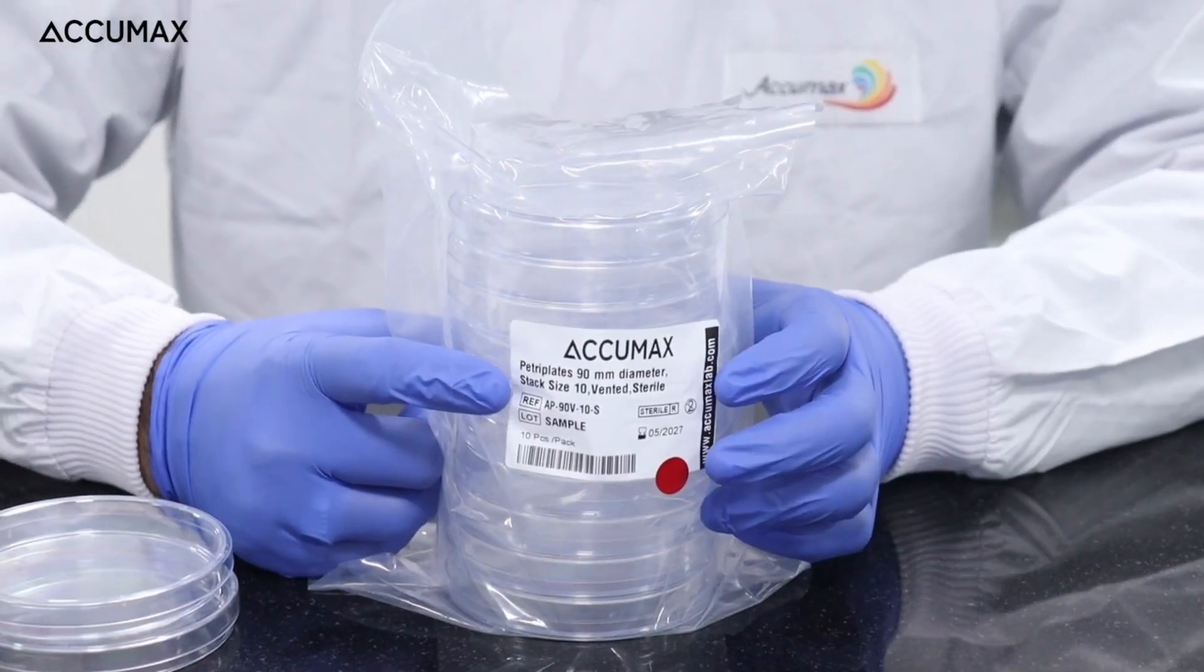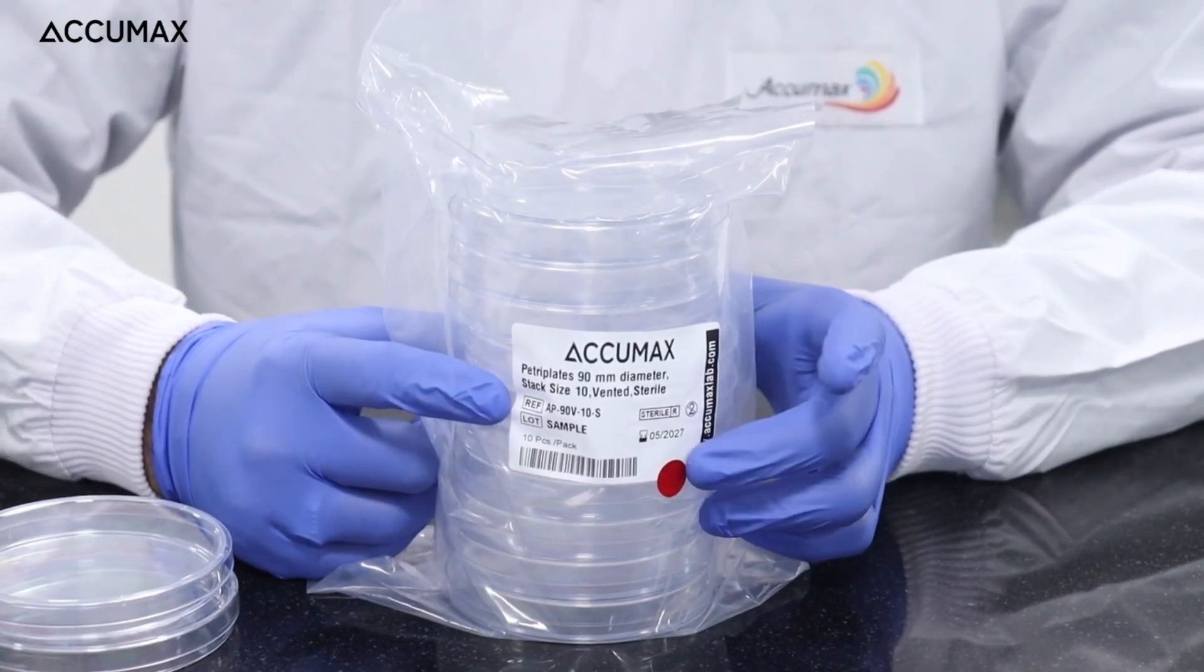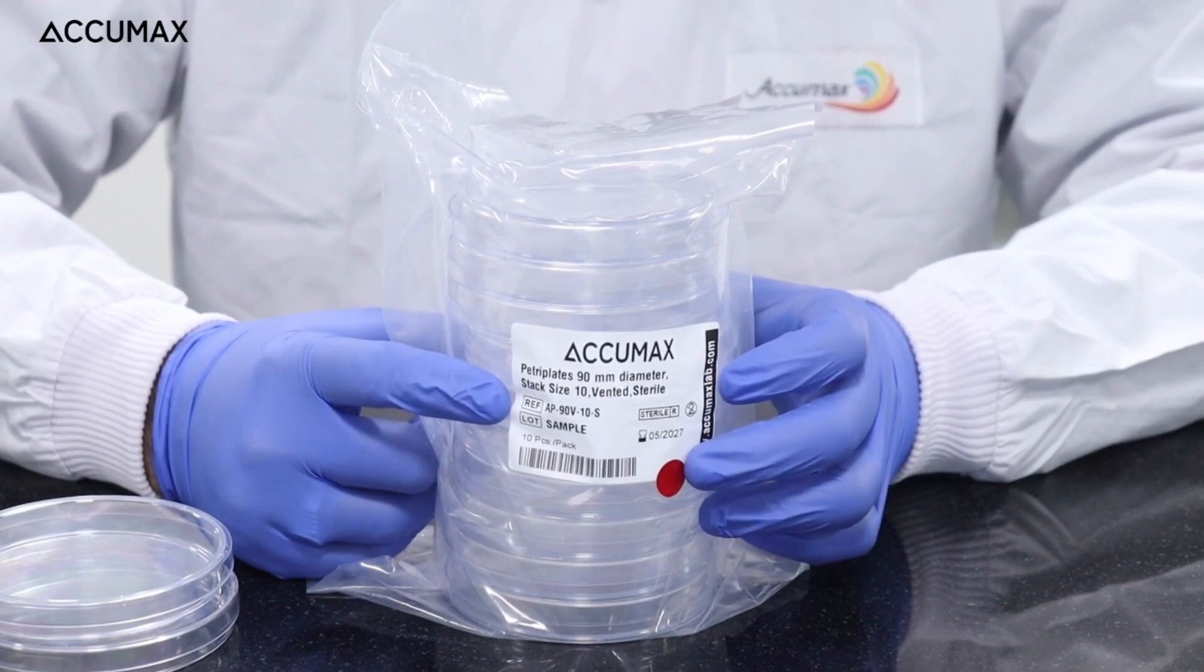Accumax petri plates come with the traceability of lot number, sterility and expiry date on the back packaging.